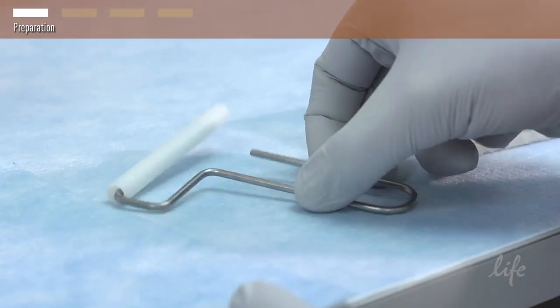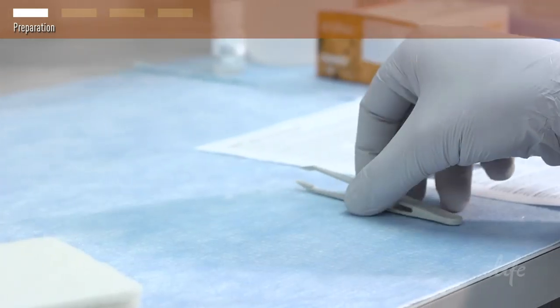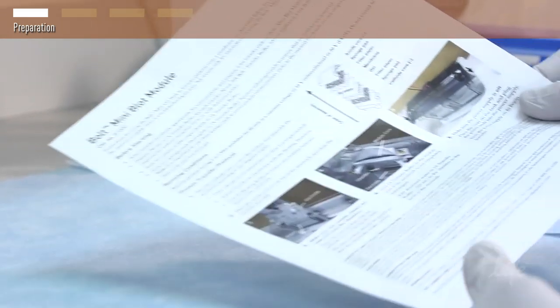Included in the Bolt blot module kit is a roller, sponge pads, tweezers, and the quick reference card.